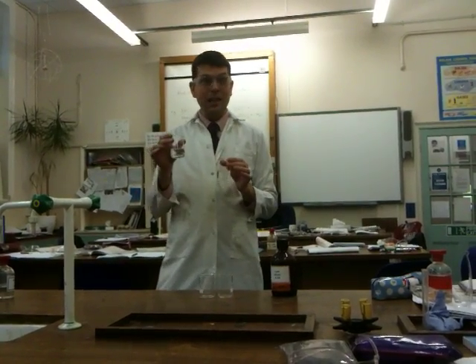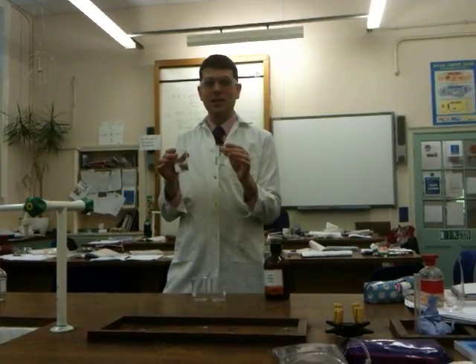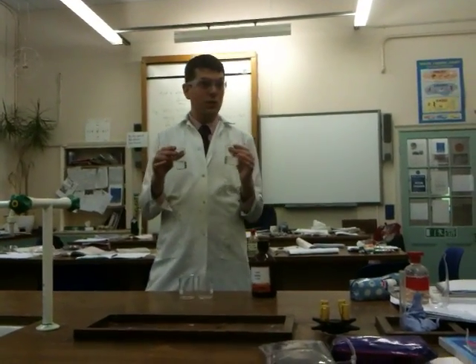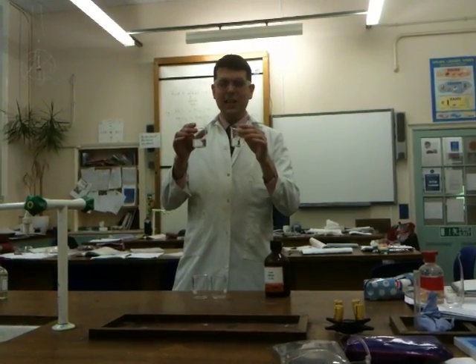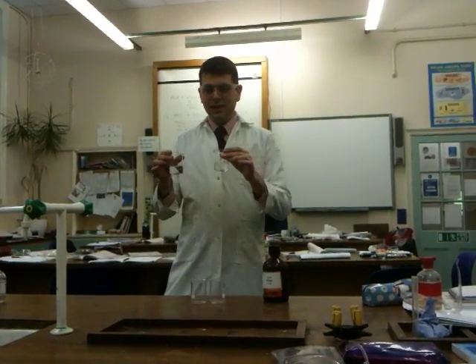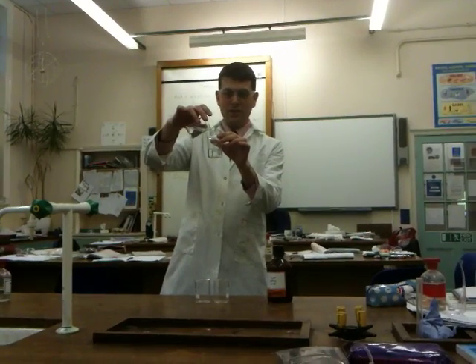But the lead ions have been secretly fancying the iodide ions in this beaker for a long time now. And as soon as they get together, they will form what is called a precipitate. They will join together. And if you join together in the swimming pool, you start to sink. You'll sink to the bottom of the pool gradually. This is the precipitate that we're going to form, lead iodide. So in we pour the potassium iodide into the lead nitrate.